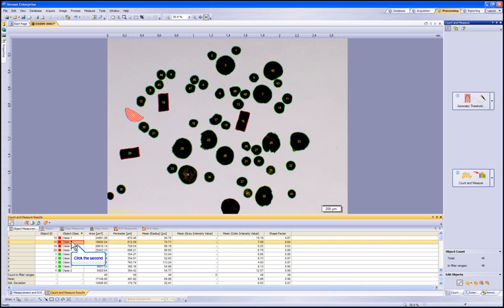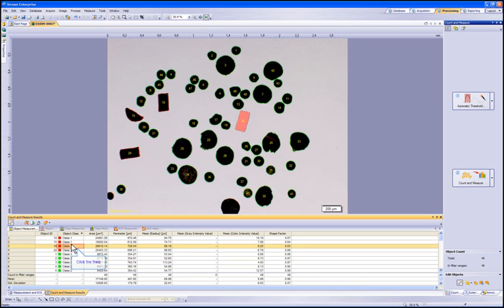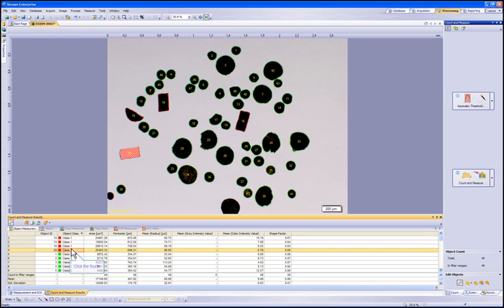As you can see, this is a broken particle and we will need to remove this particle entirely from our evaluation. This is the third in the list. And the final particle in Class 1. Now go back to the second particle listed by clicking on it so we can remove it.